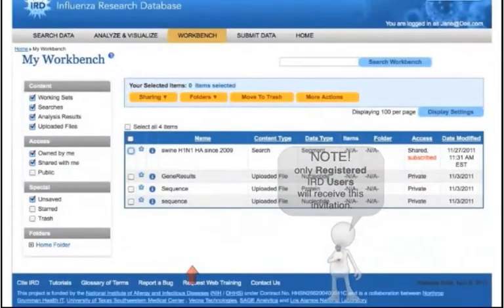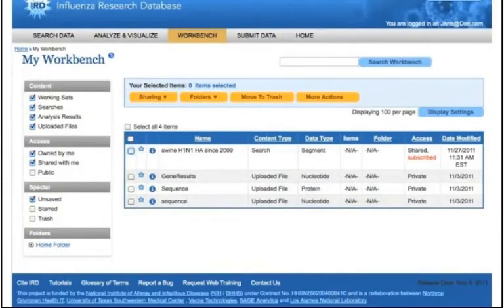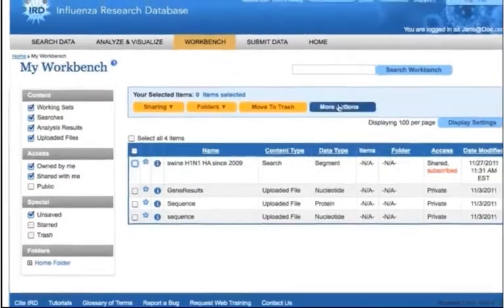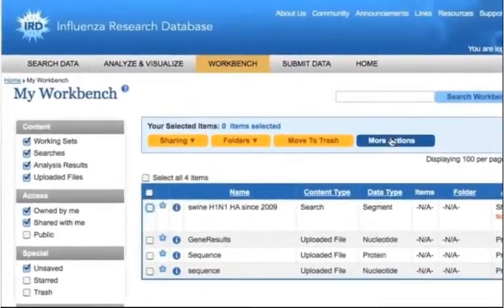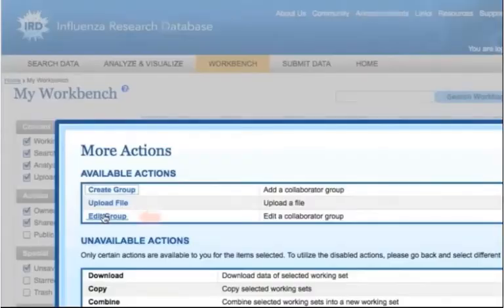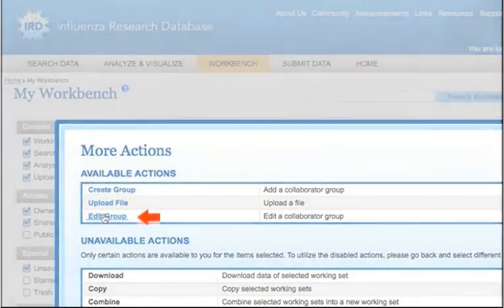You can now return to your workbench. If you want to change the group name in the future, click on the More Actions button and select the Edit Group link.